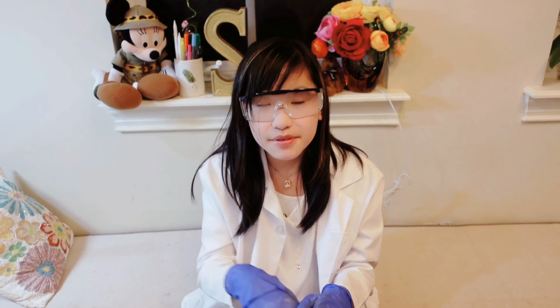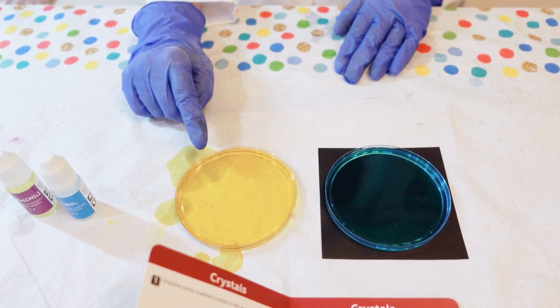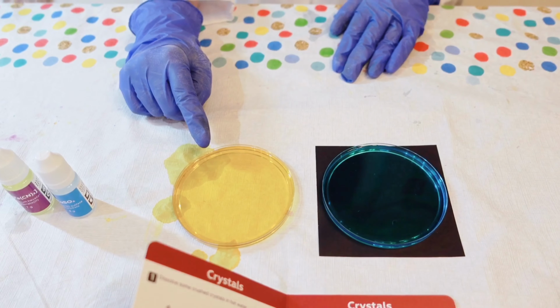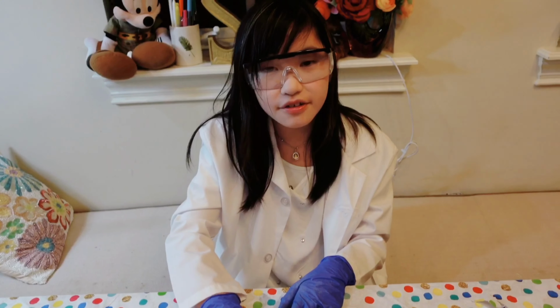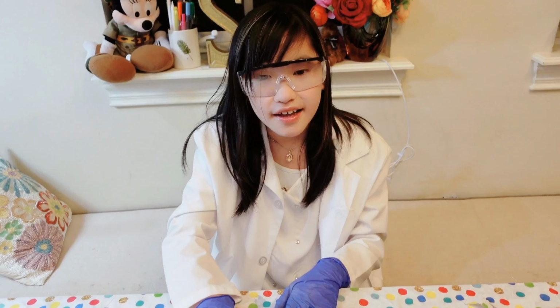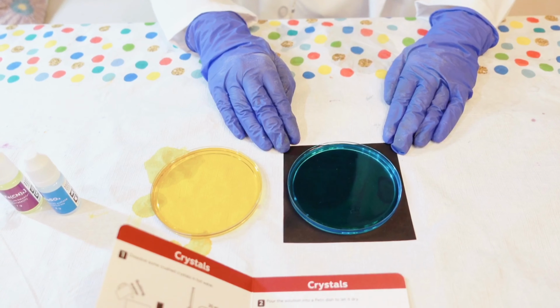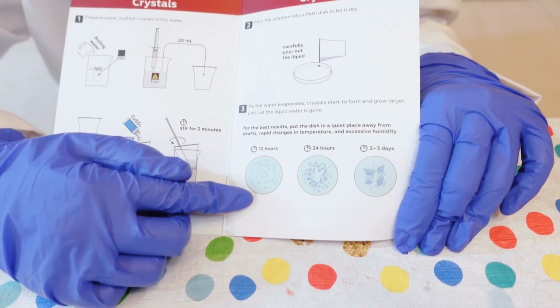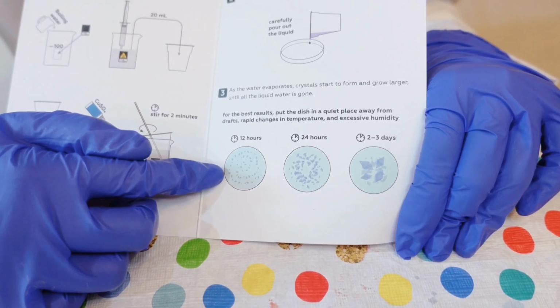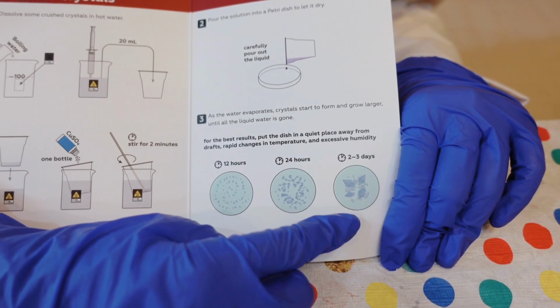So we poured the potassium hexacyanoferrate solution into the Petri dish, and it will give us a blood red color. And the copper sulfate pentahydrate will make us blue crystals. We're gonna wait for 2 to 3 days, and as you can see, it's gonna be like this in 12 hours, 24 hours, and 2 to 3 days.